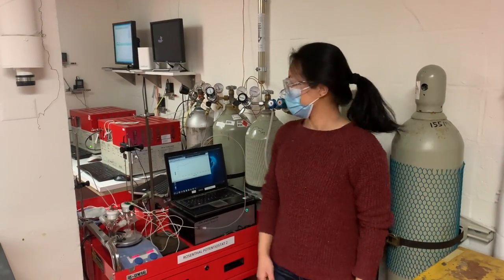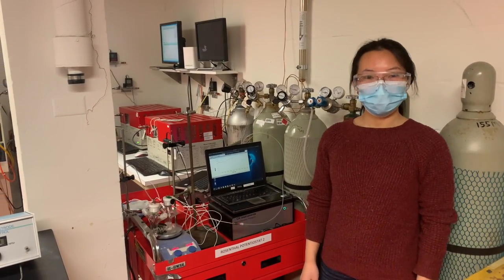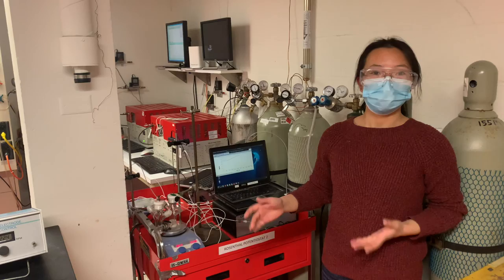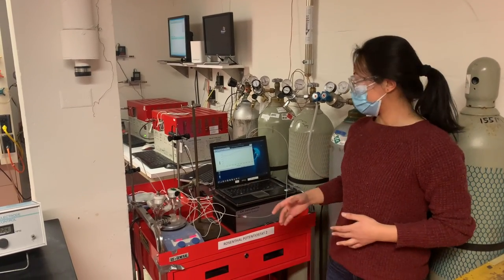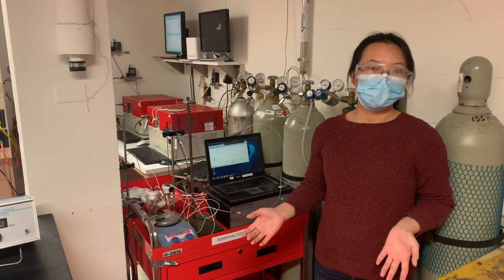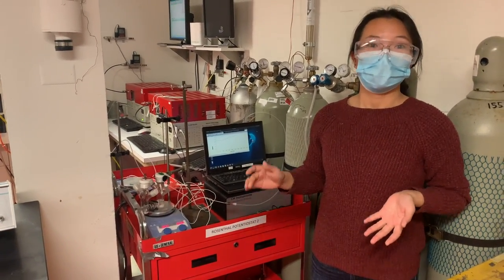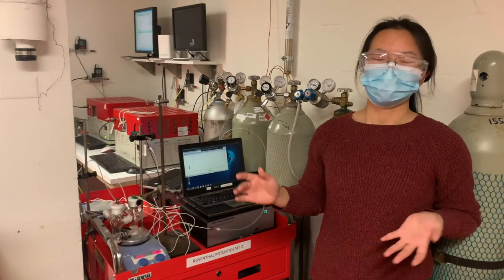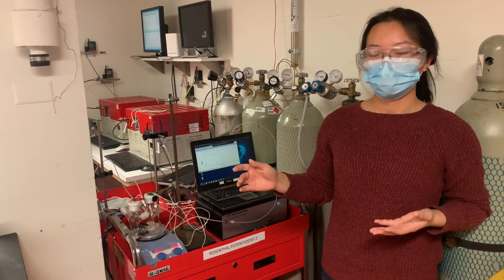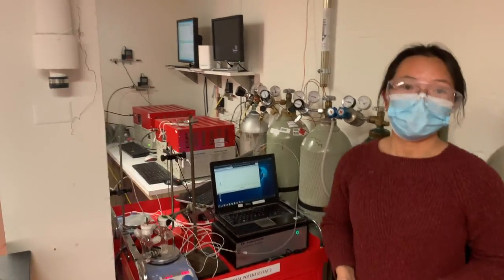Hello, I'm Lin. Here we have two potentiostats that are coupled with SRI gas chromatography. With this setup, we are able to run electrolysis under various conditions and detect the gas products quantitatively. For example, we can perform electrolysis on inexpensive catalysts such as bismuth, tin, and glassy carbon electrodes. The CO2 reduction gas products can then be detected on the SRI gas chromatograph, depending on the catalyst and composition of the electrolyte.